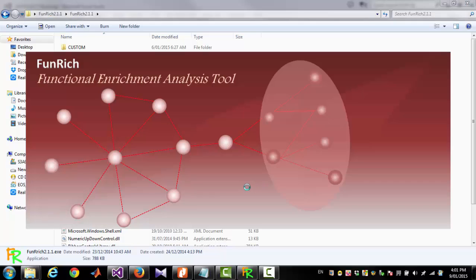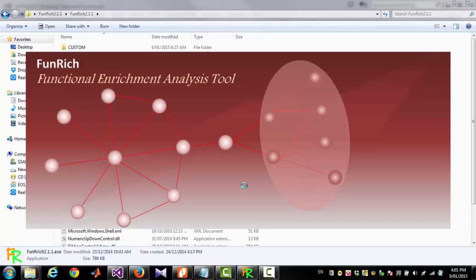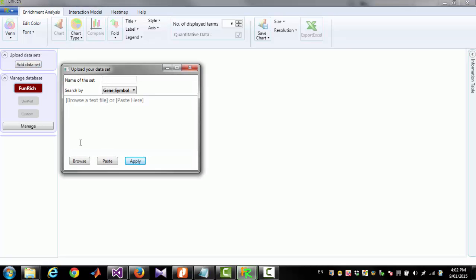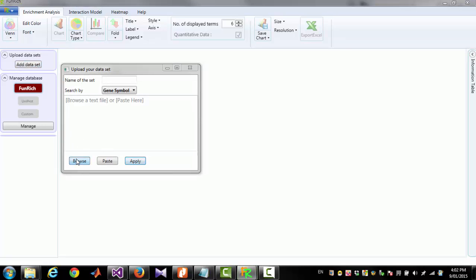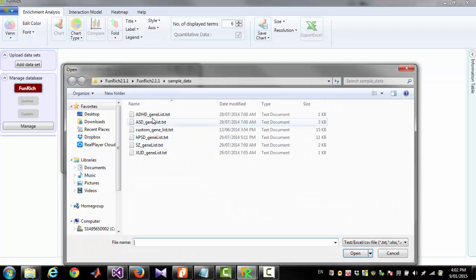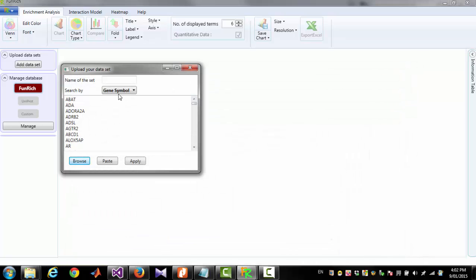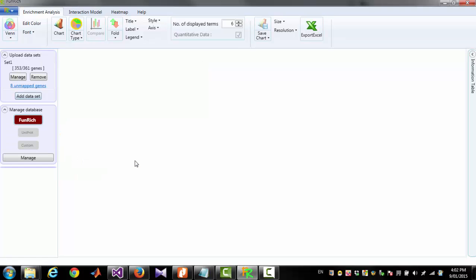At first let's start FunRidgeTool. Now I am going to upload 4 GeneLists. To do that I am clicking Add Dataset then Browse and select a file containing GeneList, giving a name Set1 and clicking Apply.